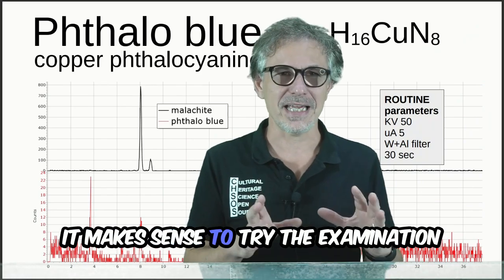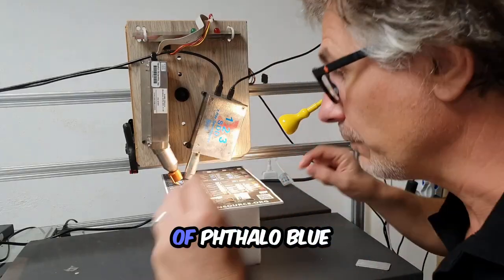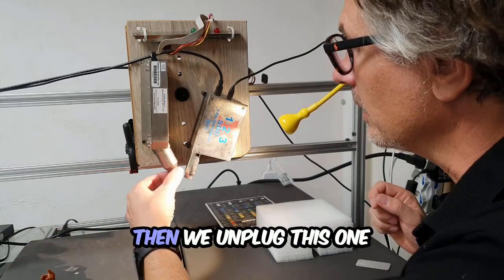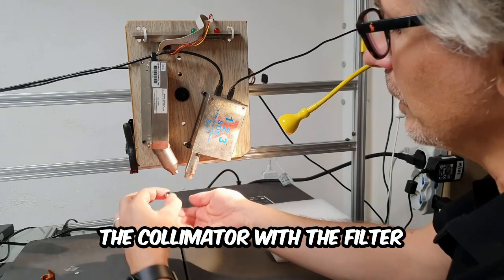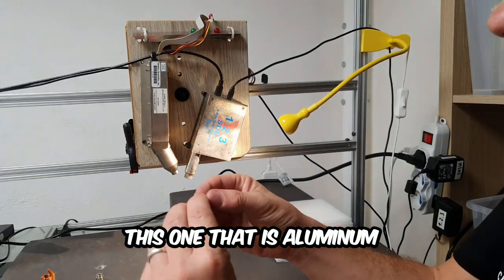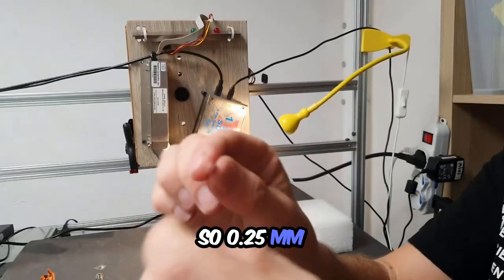It makes sense to try the examination changing the filters in the tube. Now we do the measurement of phthalo blue, but we change the filters. Remove the cover, then we unplug the collimator with the filter. We remove the filter inside and replace it with this one that is aluminum 1/4 of a millimeter, so 0.25 millimeter.